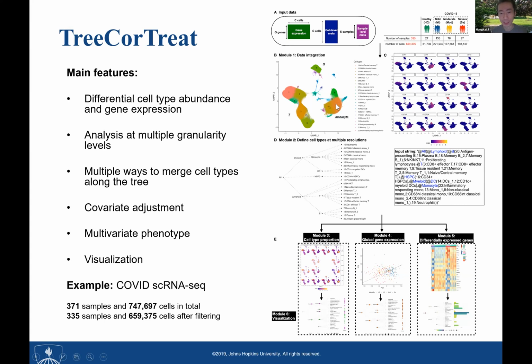Once you are done with this, and this integration is no longer used, and when you start to do differential gene expression analysis, you have to go back to the original gene expression values, and those expression values are not batch corrected.